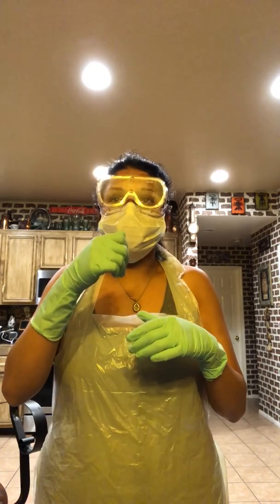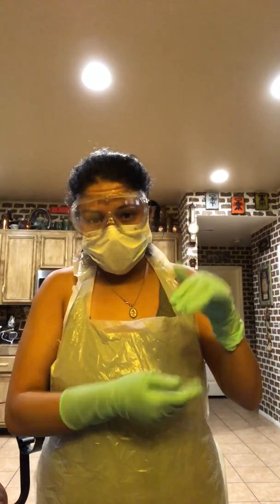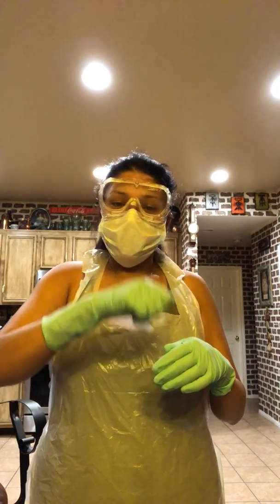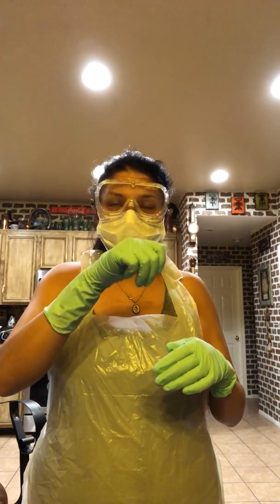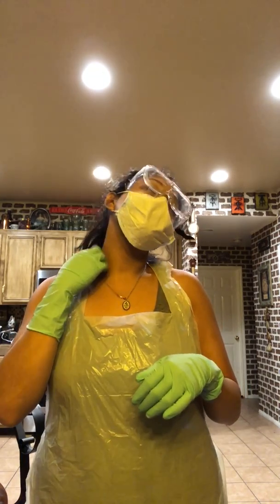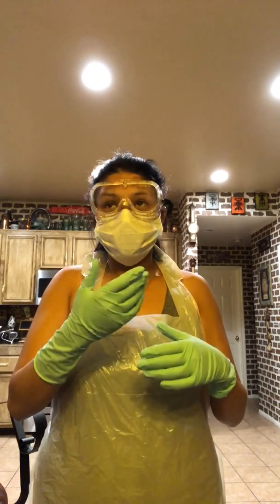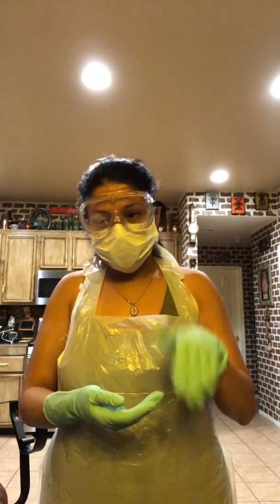I placed that in the 10^-1 tube, and after that I made sure I squirted up, squirted down, squirted up, squirted down. Of course, it was sterilized with the alcohol before I did this. I then started mixing the yeast into the sterilized water.